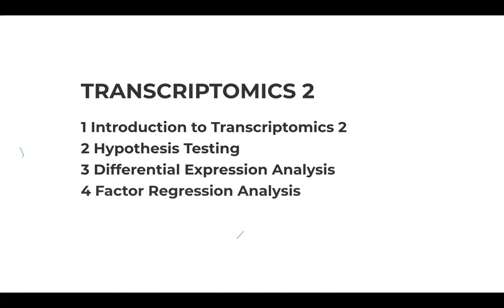Today, we are going to talk about how to compare these two groups with two different features, two different factors. So we will be trying to understand how two samples coming from two different organisms can have different effects on gene expression.